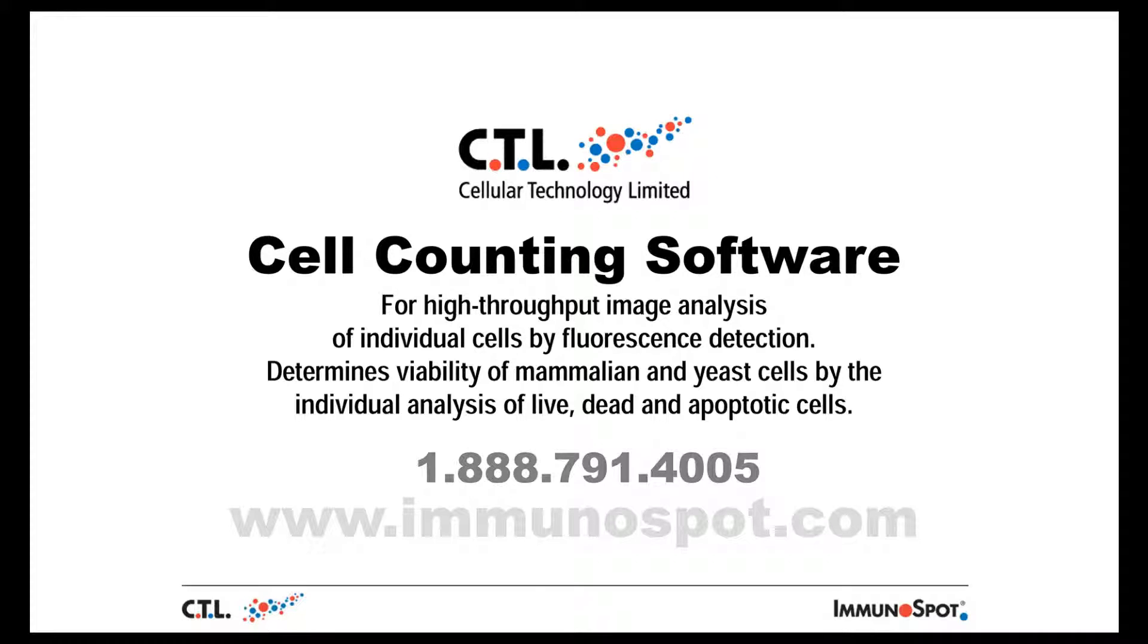The CTL cell counting software is used to primarily detect viability of PBMC and is accompanied by the CTL cell counting reagent, comprising the fluorescent dyes necessary for the staining of these cells.